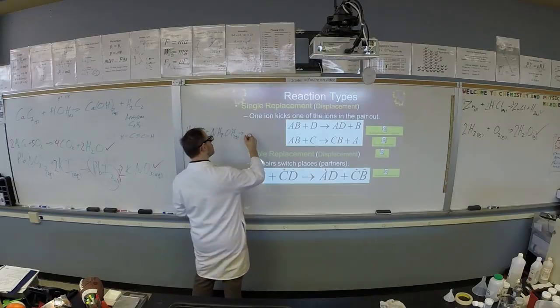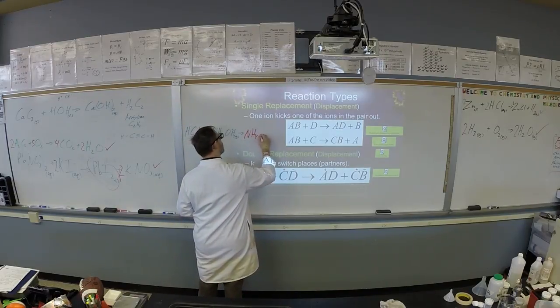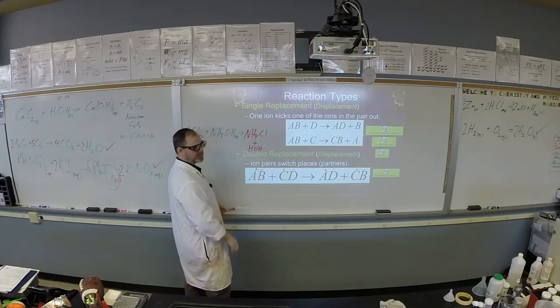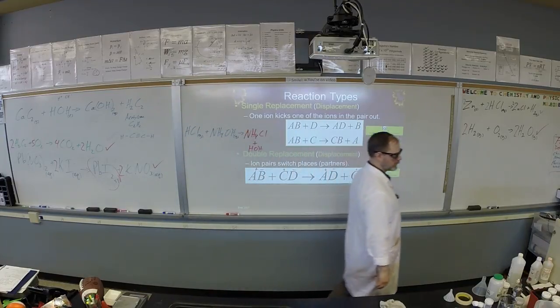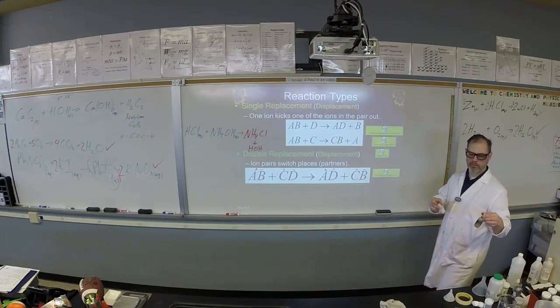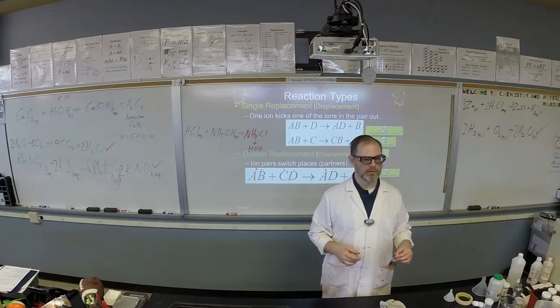So it's going to make NH4Cl and, of course, water, HOH. And I'm going to do this in the gas phase. I'll do a little bit in front of you, then a whole. I should just do it all in front of you.